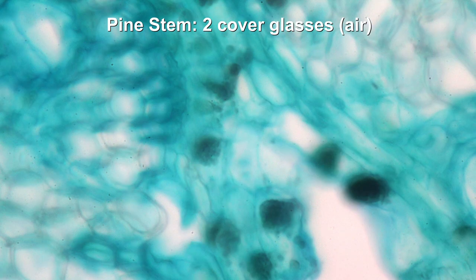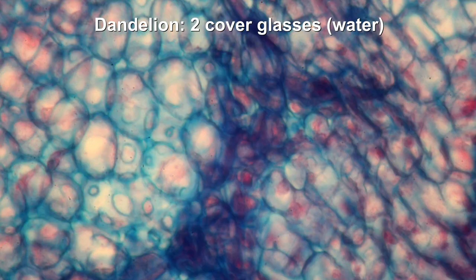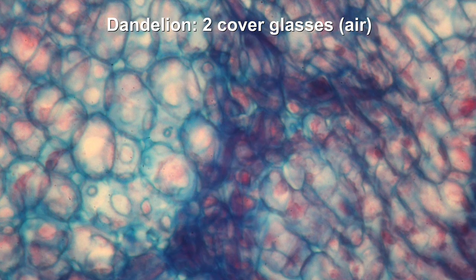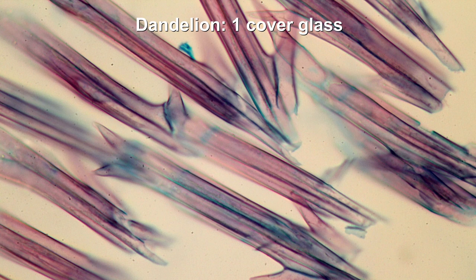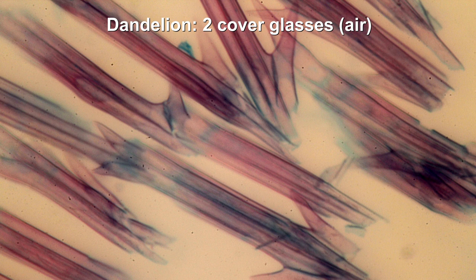This shows that cover glass thickness is indeed very important, especially when using high magnification. The story repeats here as well — look at the contrast specifically. When we increase the cover glass thickness, image quality deteriorates, the contrast goes a little bit lower, and the colors kind of intermix a little bit more. Here this one already looks like there's a white veil over the whole image. The last example, also a dandelion, did not show such a big decrease, and I think it depends on whether the original specimen already has high contrast.